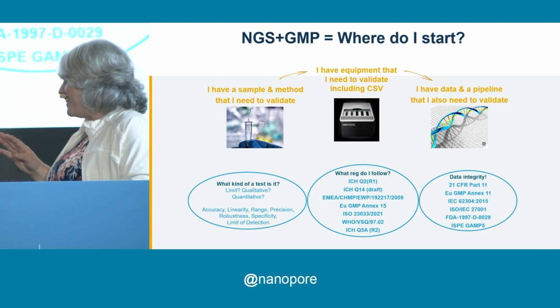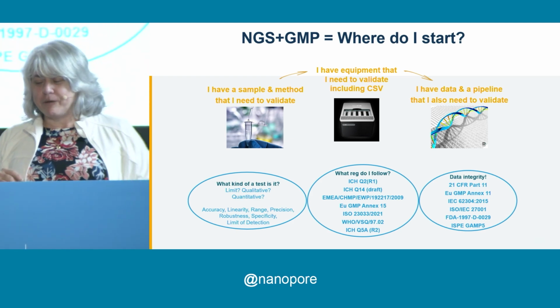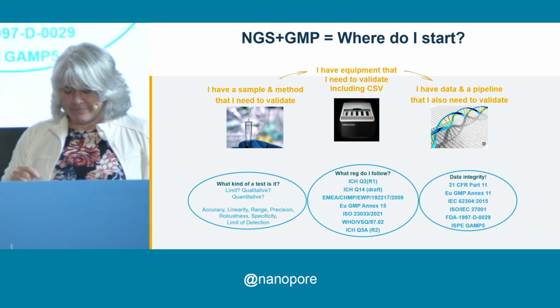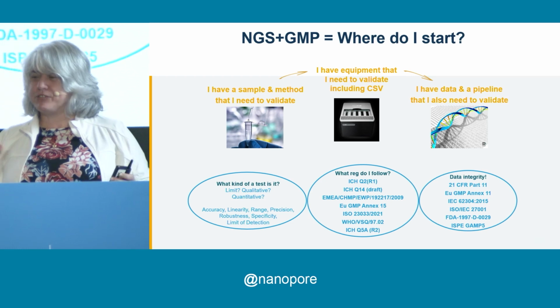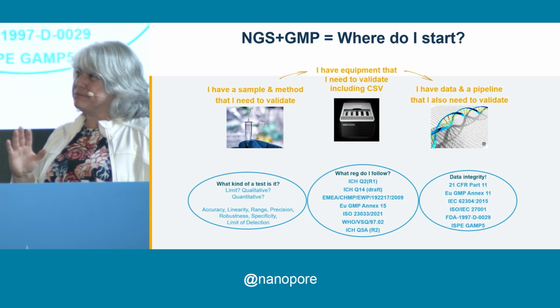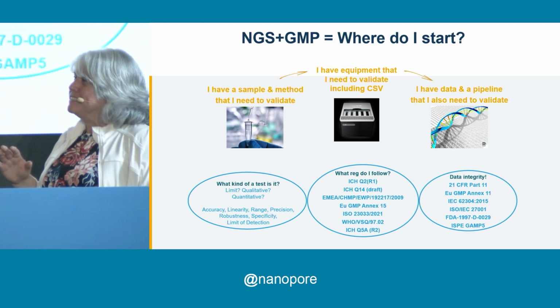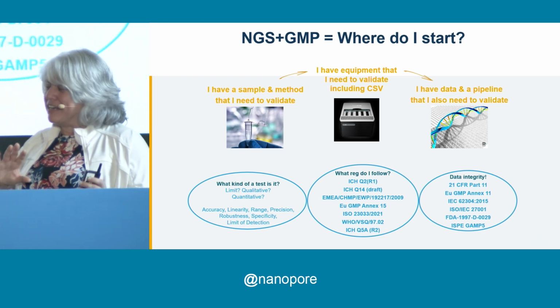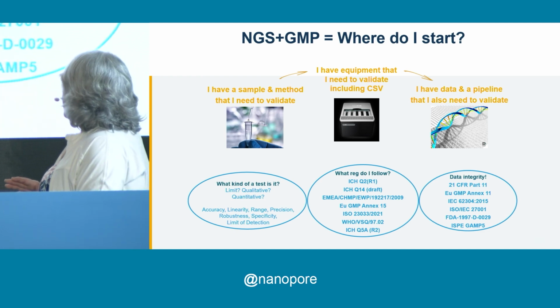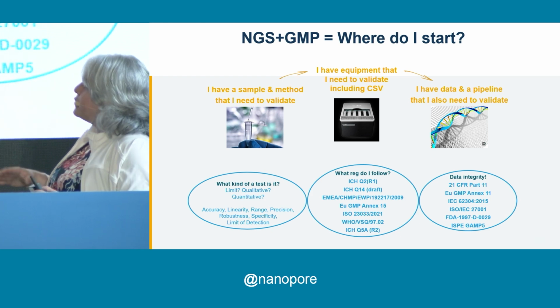And in full disclosure, we did have somebody in our lab who thought, oh, look, there's a software upgrade, and went, ding. And then I thought, oh, okay. His name is Crispin, if you want to. Crispin? Crispin, we weren't supposed to do that. I understand your R&D, but that was a no-no. Oh, what do we need to do now? We need to go down a whole foray of how to get it back to where the instrument was when we validated it.